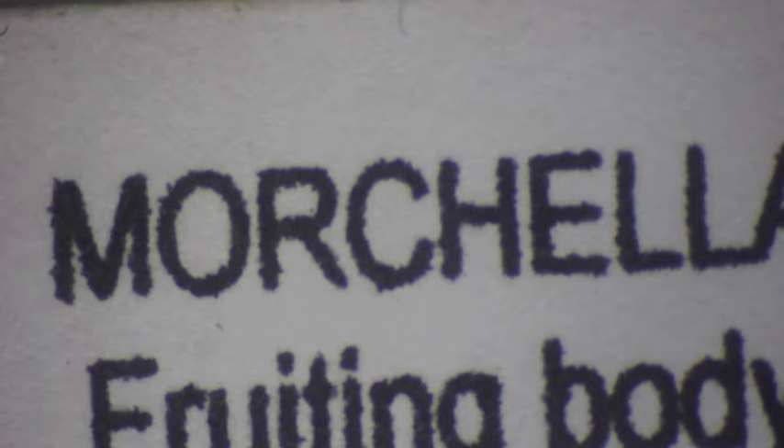We're just going to quickly look at the slide here. So this is a slide — I have it on the dissecting scope. This is Morcella, which is an Ascomycete. This is a cross-section through the mushroom head of a morel, and it is called a cup fungus. Each of these little indentations is a cup.